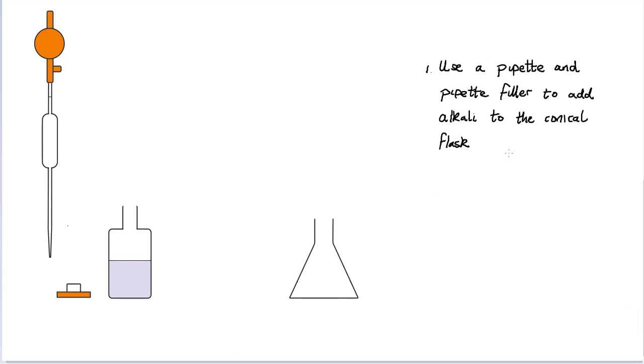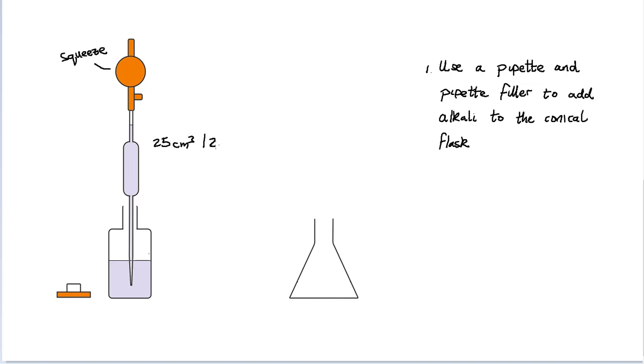The first thing I'm going to do is use the pipette and pipette filler to add alkali to the conical flask. I've fitted the pipette filler onto the end of the pipette and added that to the alkali bottle. You squeeze the bulb and that will draw the alkali up into the pipette. We're going to take it up to this level marker here, and we can carefully adjust the level of the alkali in the pipette by pressing on the valve here - there's a valve which allows air in and out so you can adjust that position to get it exactly right. We now know that we've got 25 cubic centimeters or 25 milliliters of alkali in our pipette.